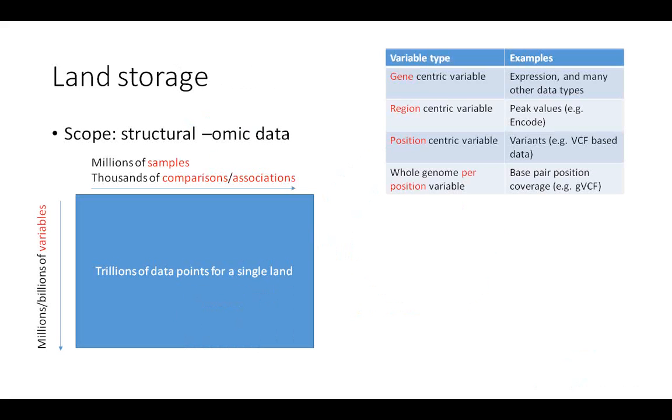There is a need to store this type of information because I heard people saying that we need to have the GVCF stored: when we have variants, we want to make sure the position is actually covered. If we see a false positive, I want to be confident about it by getting extra information.